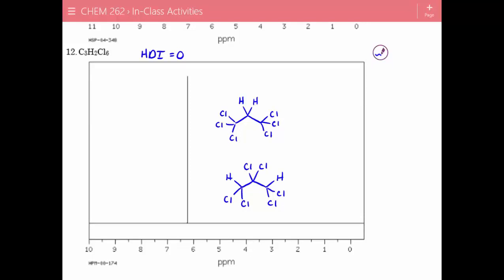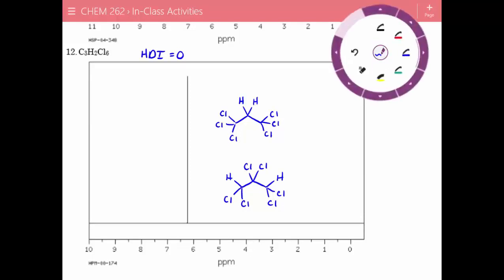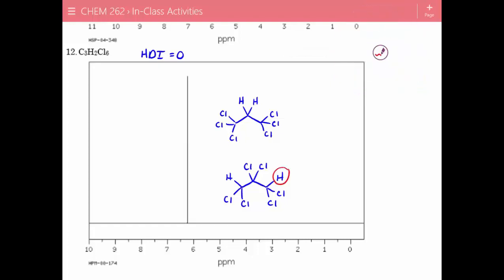We've got a decision to make. If we're looking at the protons of interest, they're going to be equivalent on the right and the left. But we've got to ask ourselves, which proton is more likely to be shifted all the way over into the aromatic-like region? And so we've got to ask ourselves, which one's bonded to the most polarized carbon? And in this one, you can see it's bonded to a carbon attached to 2 chlorines.